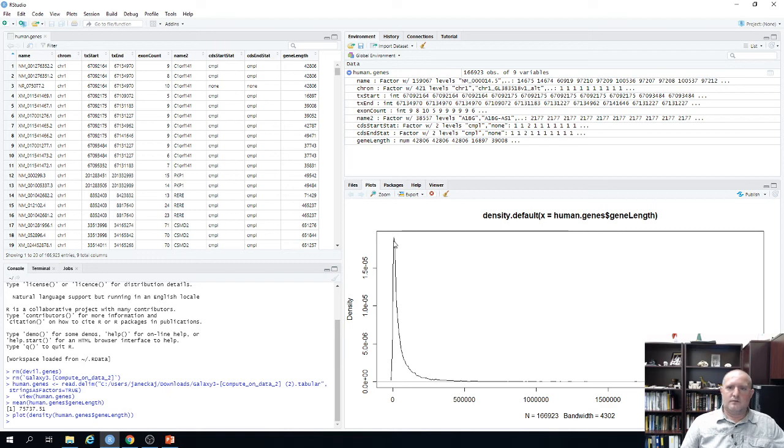Okay, so I hope that you found this useful. I hope that this gave you some information on how you can get data from the UCSC Genome Browser. Remember that all those tracks in the UCSC Genome Browser are actually data sets that are publicly available for you to analyze, and so you can download them.